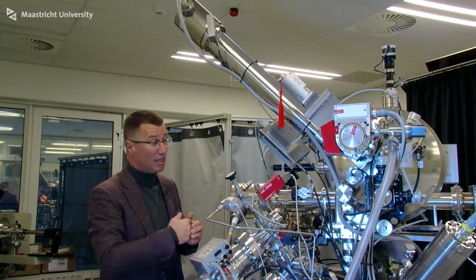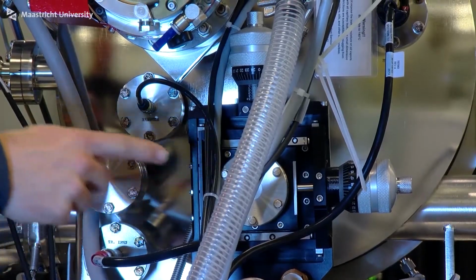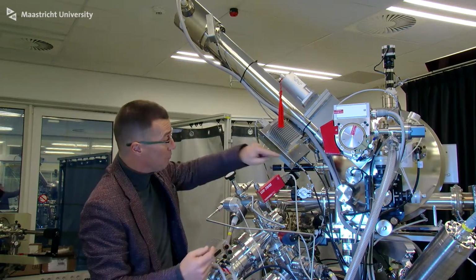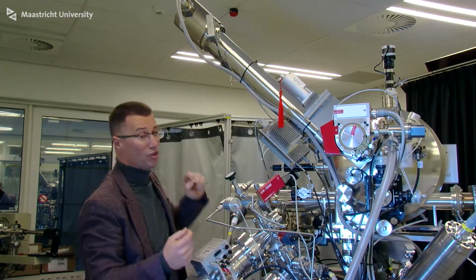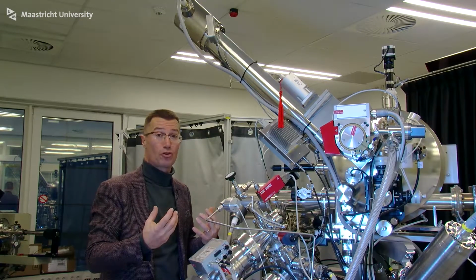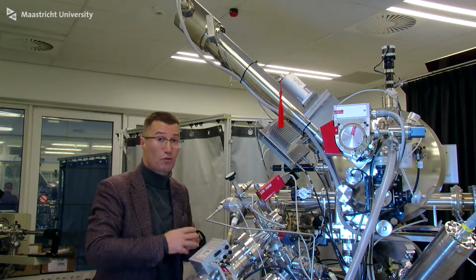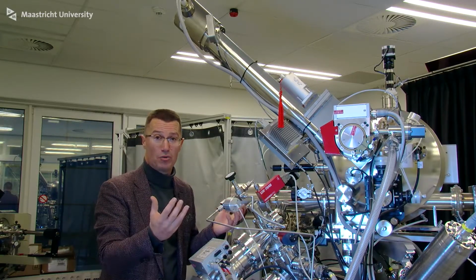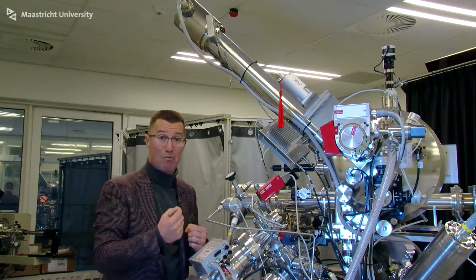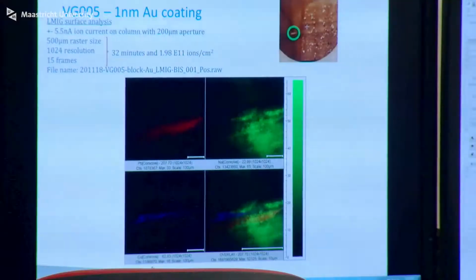What happens is that ions fly through this drum, and right here they collide, they fall apart, and the fragments are injected into this tube. There they're structurally analyzed and give us the chemical structure on the 15 nanometer spot that happens right there on the surface of a cell, a piece of tissue. Really unraveling the chemical complexity of surfaces at the cellular level.